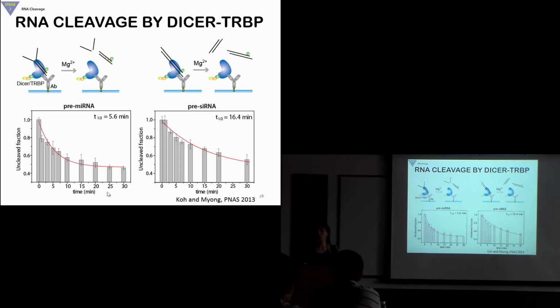We typically use both FRET and PIFE, because sometimes there was a very nice case where we were looking at protein binding, and if you imagine DNA going this way, this protein binds and forms a filament, right? This protein nucleates somewhere and then it forms a filament in one direction. When you image it by FRET, we attach two dyes like this, and when the DNA is by itself, it's flexible, so it's high FRET. When the filament forms, FRET decreases because the dye-to-dye distance keeps on changing. So we have this FRET step down, but that assay didn't tell us which way the protein was forming. Is it from this way to that way, or from the tail to this way, right?